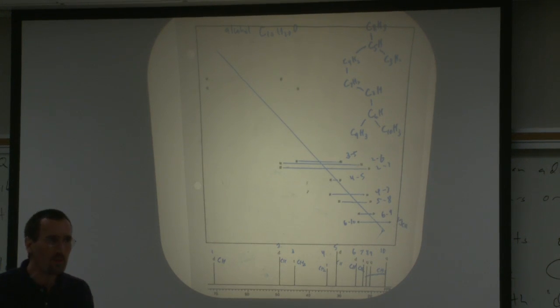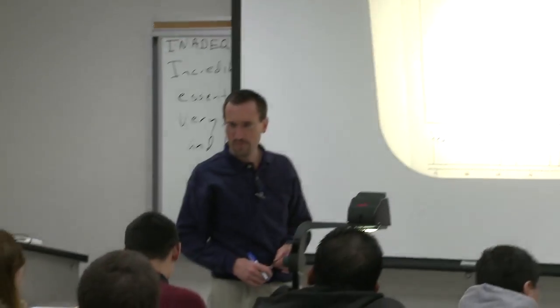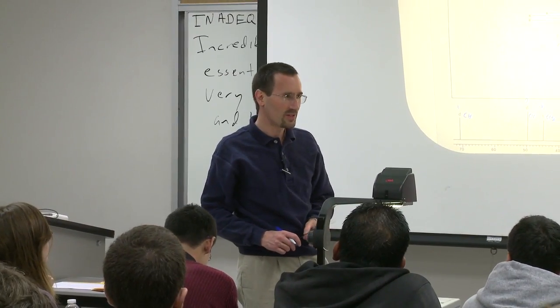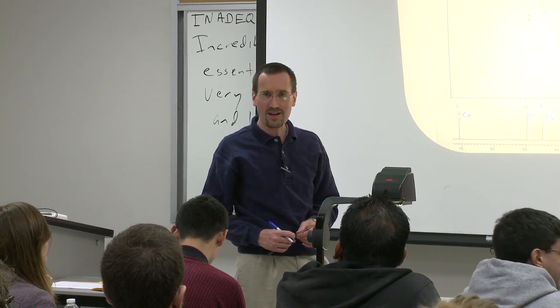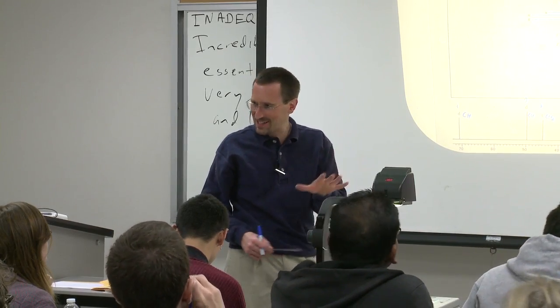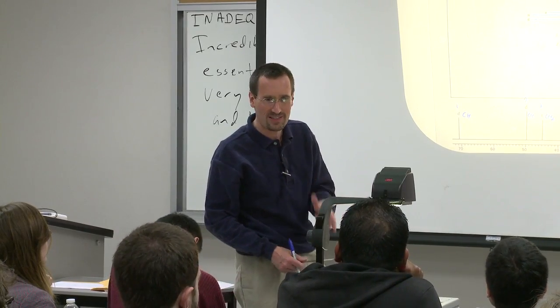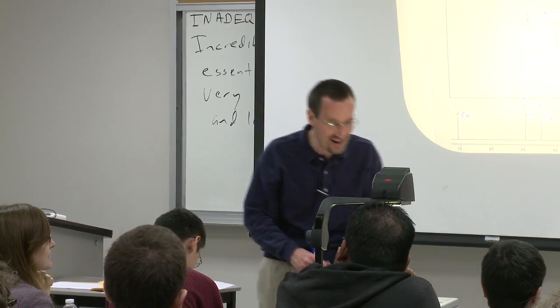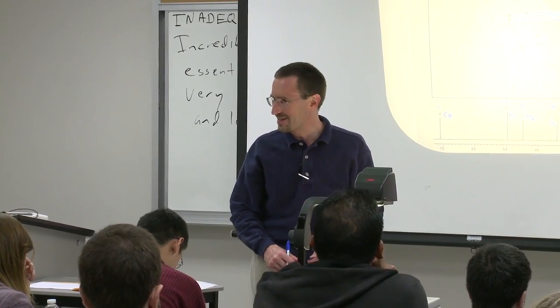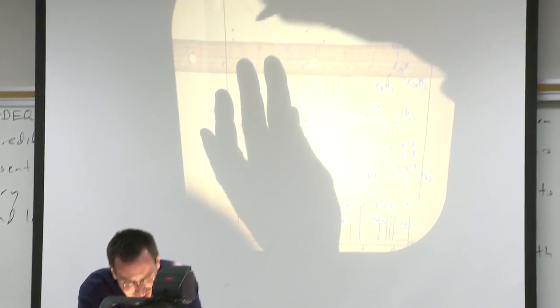Okay, so I think what was happening on the 500 was people were getting antsy over orals. So if you want to sneak back there now, I think, trying to leave a few blocks of time, but you've got this free NMR time on this course here, right? No one's going to be around Thanksgiving, right? So, you want to run an inadequate on strychnine on the cryoprobe.